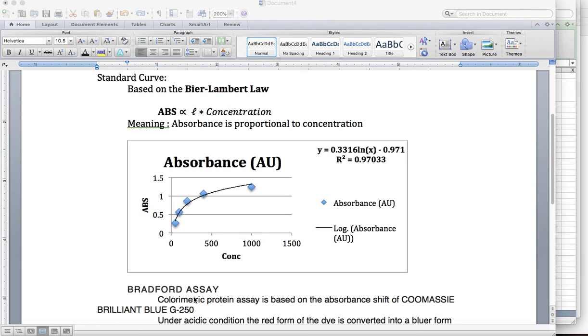So before we go on to Excel, I just want to talk about what these numbers mean. The first thing I want to point out is the R-squared value. The R-squared value refers to how well the line, which is this black one, fits this scatter plot. These points don't originally have a line, they're just points, and then Excel plots this line. And this value tells you how well it fits. So essentially, the closer to 1, the better the fit is.